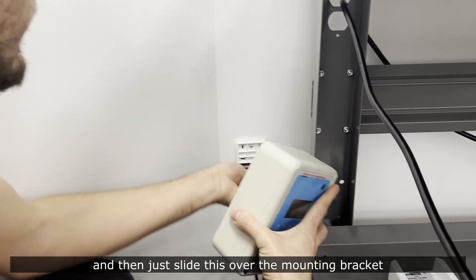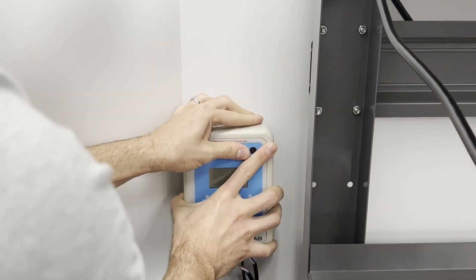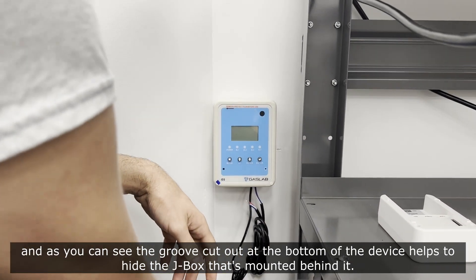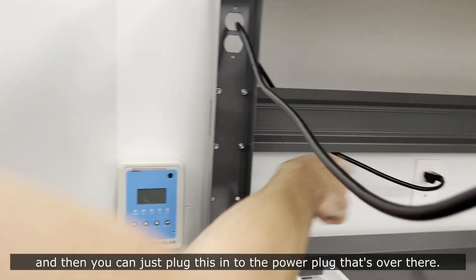Then just slide this over the mounting bracket. As you can see, the groove cut out of the bottom of the device helps hide the junction box that's mounted behind it. Then you can just plug this in to the power plug.